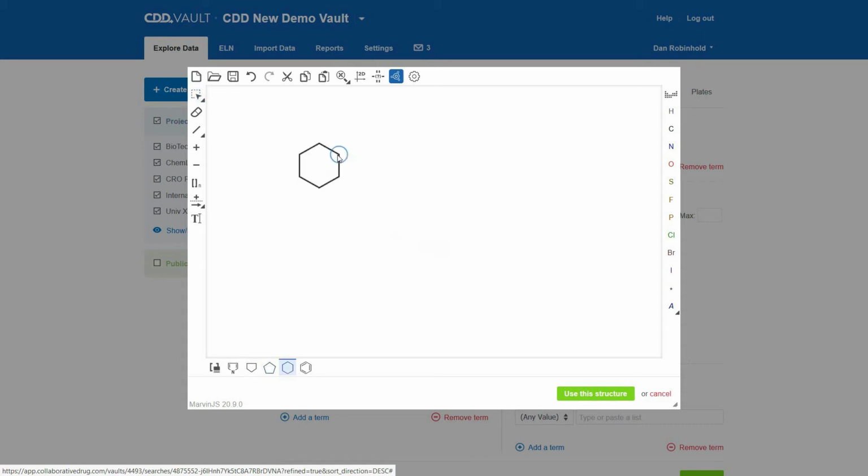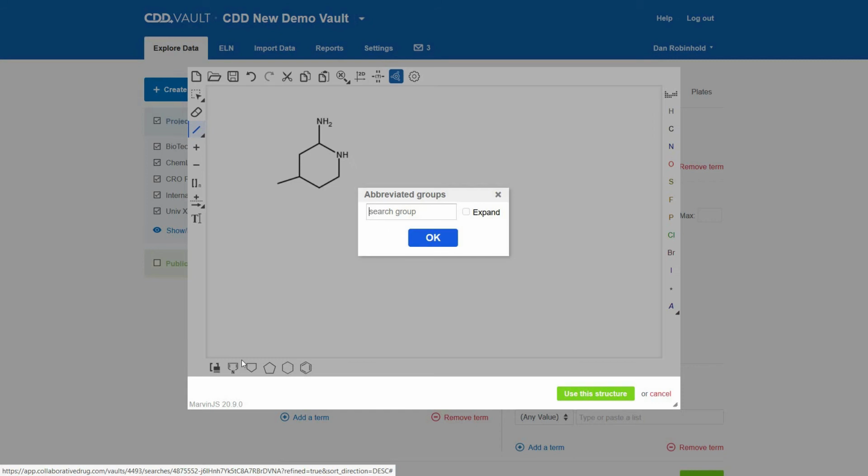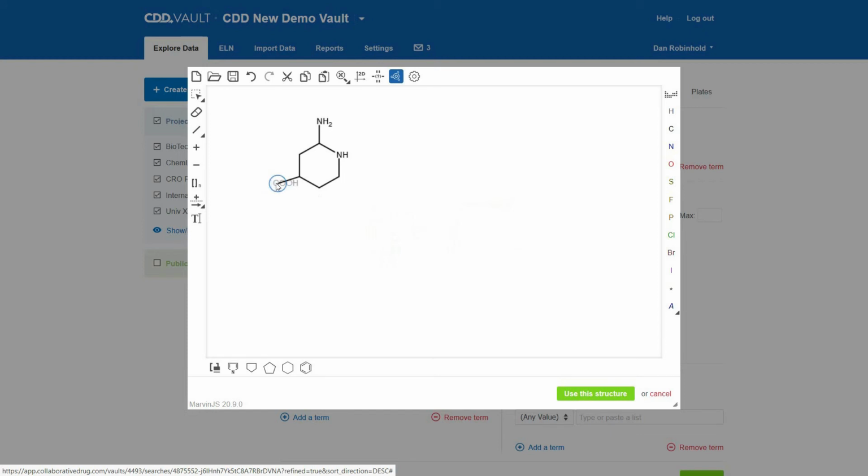I'm going to put a heteronitrogen in there, another one here, and I'm going to make a bond here, and maybe the carboxylic acid group here. Check out our help files if you are interested in learning more structure drawing tips for Marvin. Now anything that I click on turns to carboxylic acid. I'm going to make this an aromatic ring, and voila, I have drawn a structure.